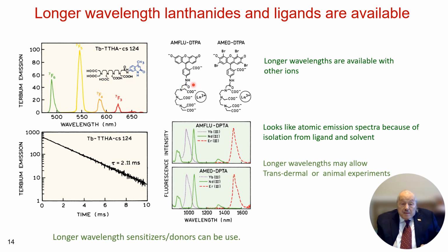So anyway, there are a couple of other longer lanthanides. I haven't seen very many publications on these, but I think they would be useful, especially if you were doing animal studies with mice or rats, because you could see the longer wavelengths through the skin.